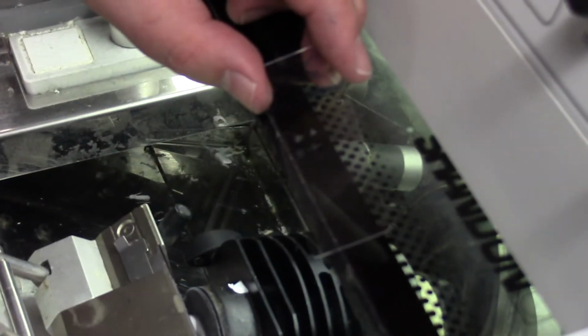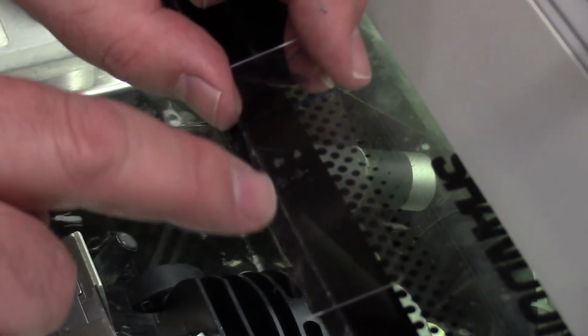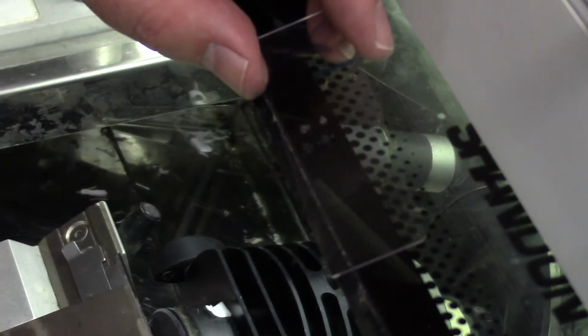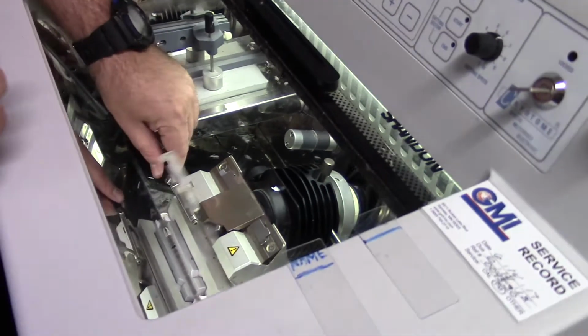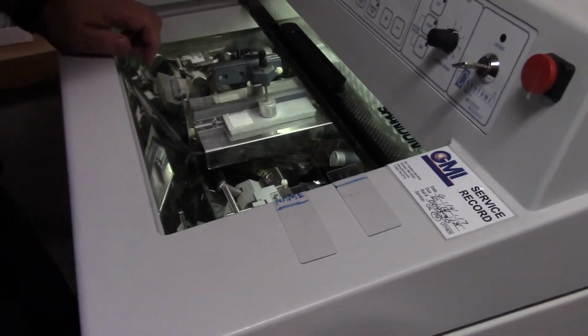There's our next piece of tissue. See how many I can fit on this slide? I've even been putting them across the bottom because I think I can get a whole other row across the top. So we could fill this slide up real good with lots of tissue sections.